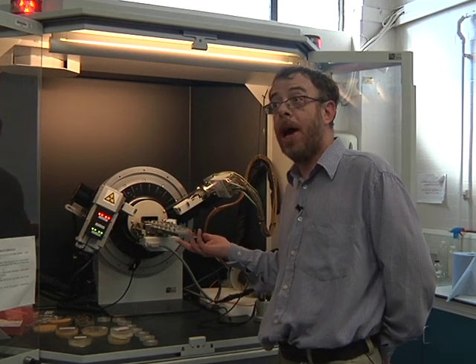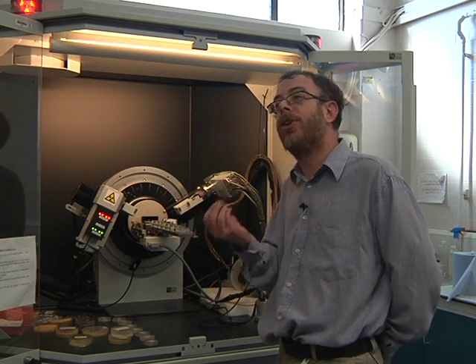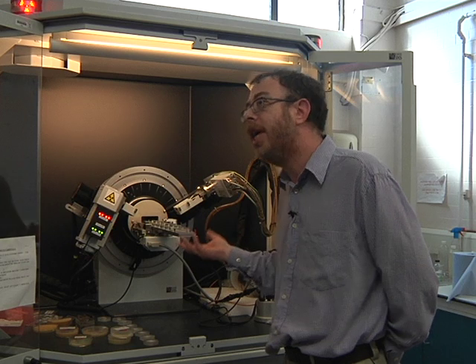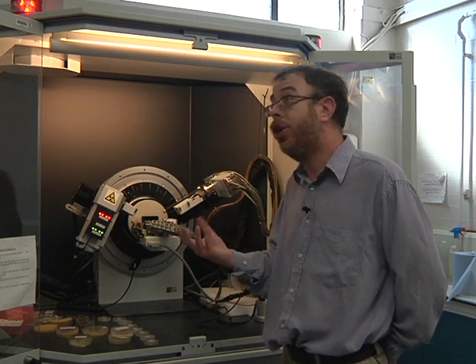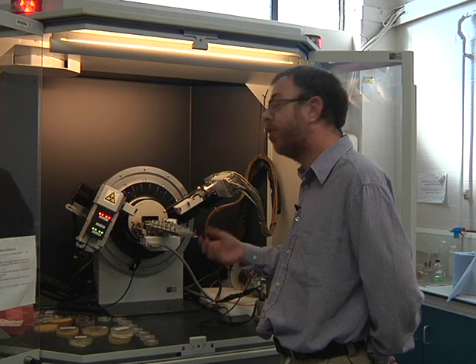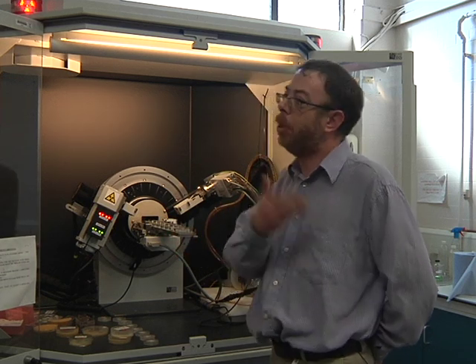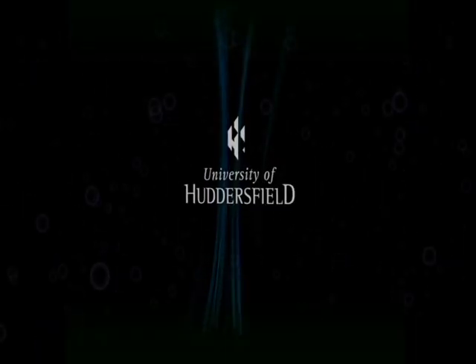This is a powder diffractometer. Whereas that machine is a crystal diffractometer, this one analyzes powder. That's great, because getting crystals is very difficult — that's the hard part. This machine, you don't need crystals. You don't get as much information as you do with a crystal machine, but it's easier to get the samples. You still get a lot of information, but not as much as that one.